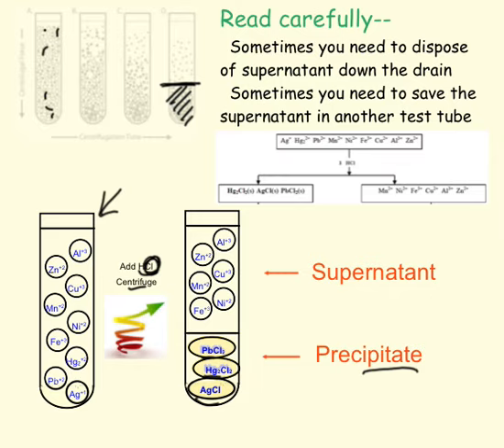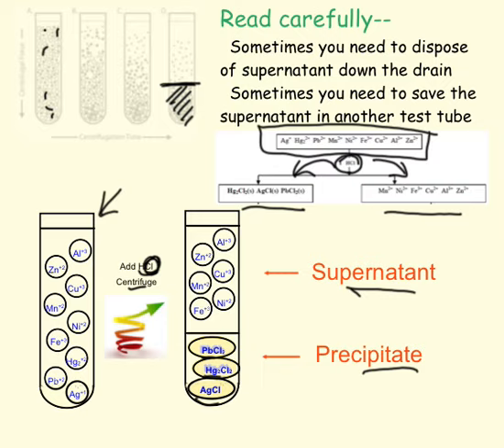The rest of those ions are going to stay in solution up at the top, and that's referred to as the supernatant. So just to remind you, and I'm going to bring this up later, you have a flow chart there. Here we see all 9 of those ions. It quickly tells us add some acid, centrifuge. Yes, you get these 3 solids, and here we have the other 6 ions in solution.